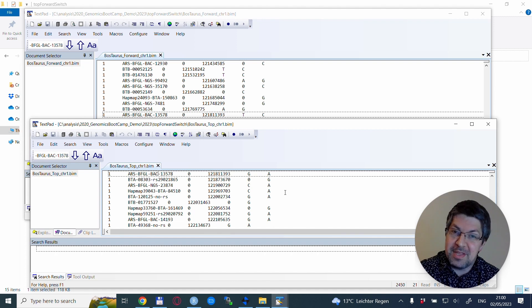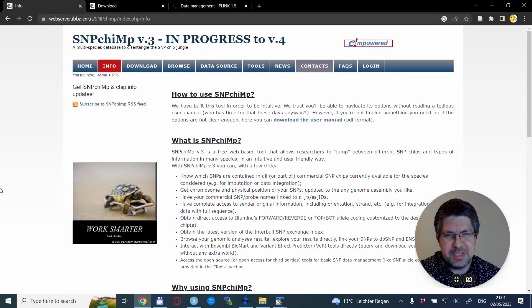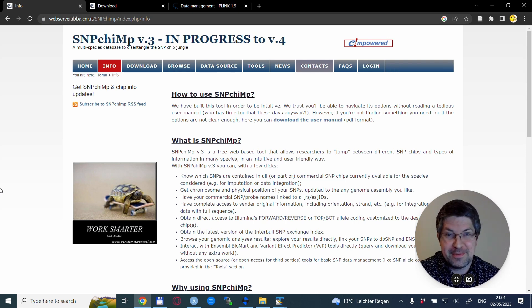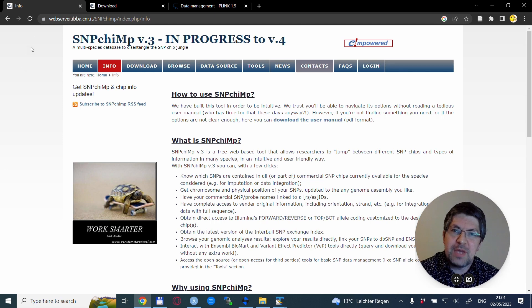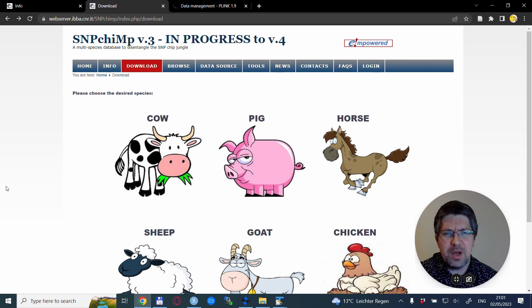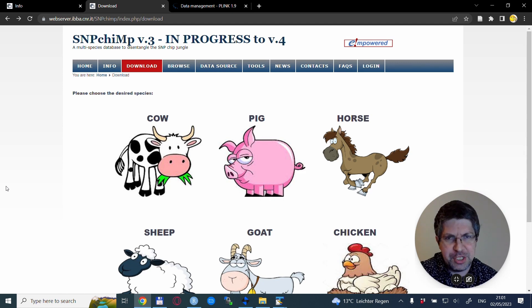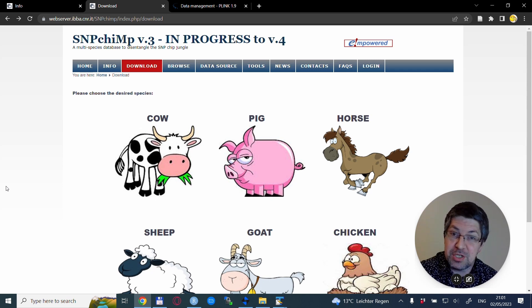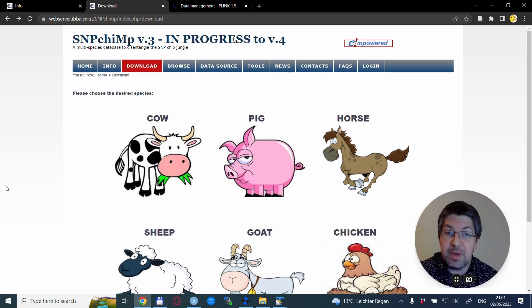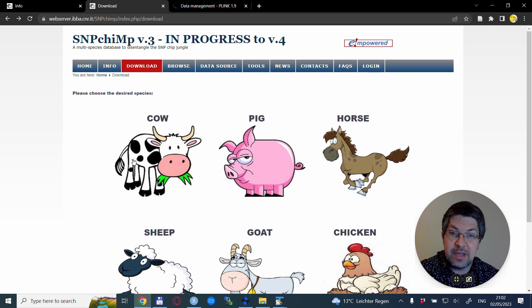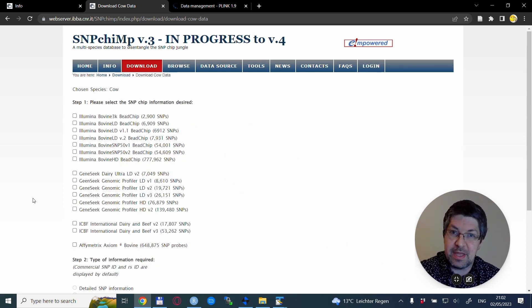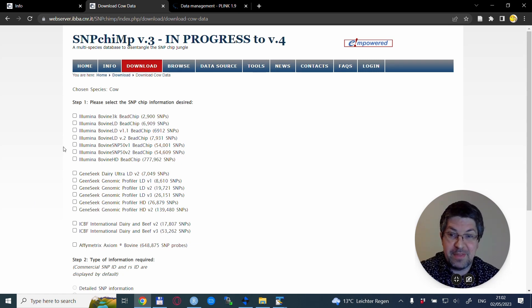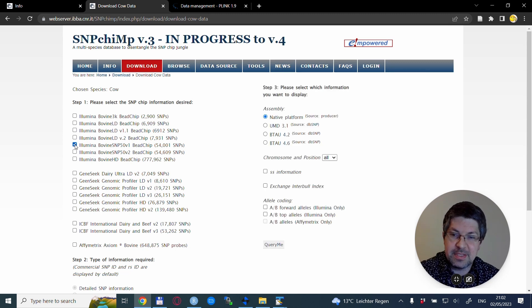I would advise to check out the SNPchiMp website. You can go to the download section, and if you have one of these species you are in luck because you can download files which you can use to convert between TOP and forward coding. In my case this is cattle data, so I click on the cow icon which lists a bunch of SNP chips. This is a really old 50K version one data.